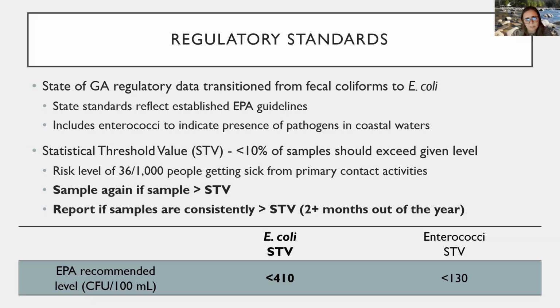So you have that value there on the slide, but we're just going to assume that most folks here today are working with fresh water. So that's what we're really going to focus on, since all of our methods are also focused on looking at E. coli, right?